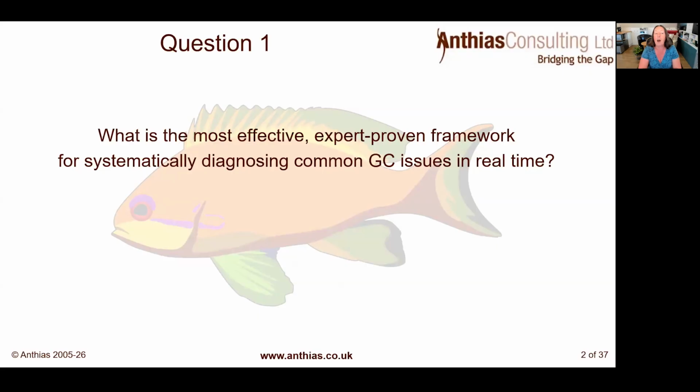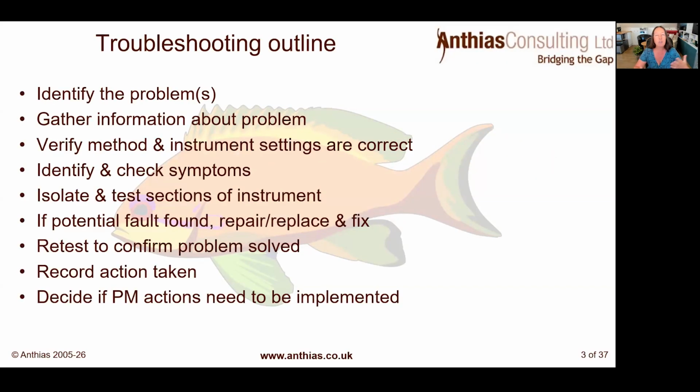So question number one was, what is the most effective expert-proven framework for systematically diagnosing common GC issues in real time? Now, I've been working with gas chromatography for more than 27 years now, and about half of my time is spent troubleshooting instrumentation, troubleshooting methods. So I'm going to take you through the steps that I'm always going through when I'm thinking about, right, what's my problem? So of course, you have your step-by-step guide you're going through.